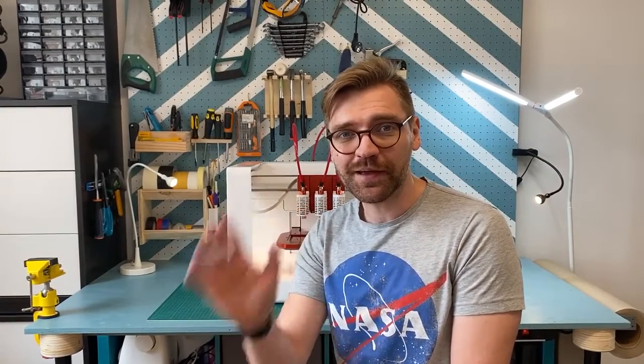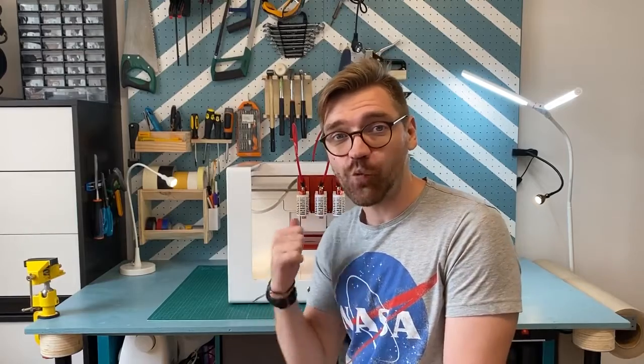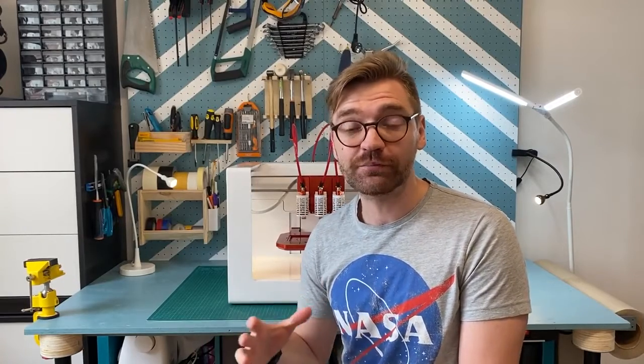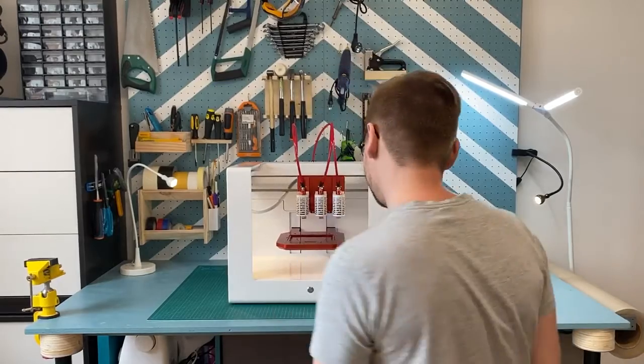Hi, my name is Jakub and I work at Allevi, a 3D bioprinting company, and that's one of our special machines. It can create complex three-dimensional shapes using special soft materials and live cells. So let's have a closer look at it.